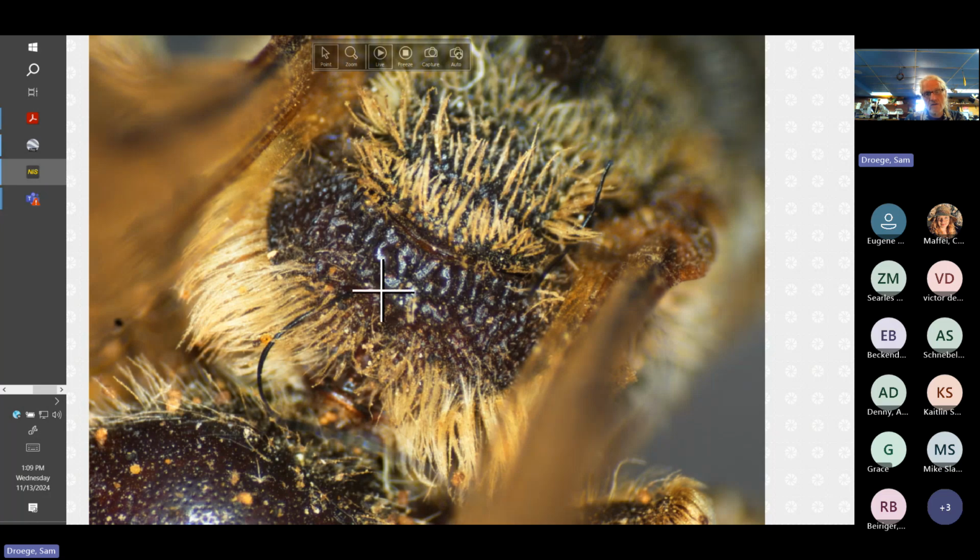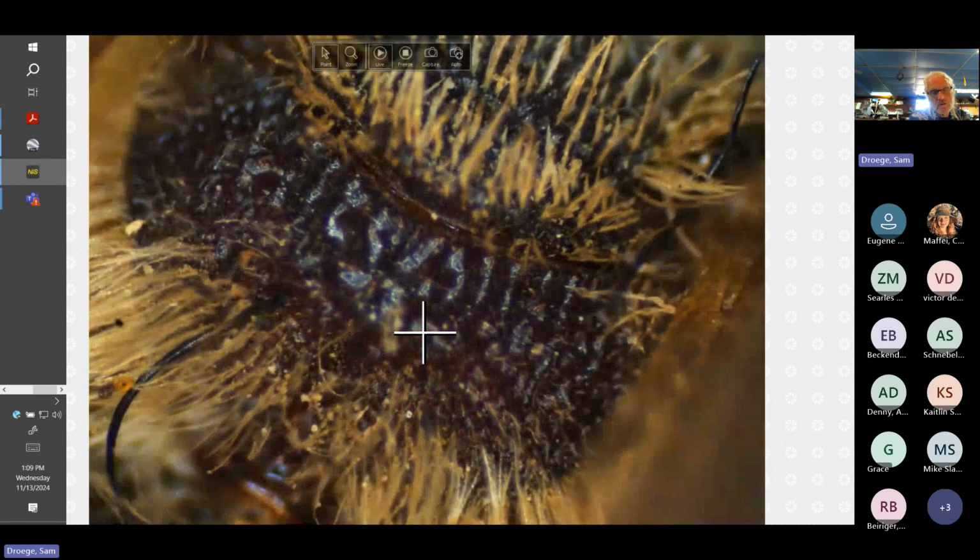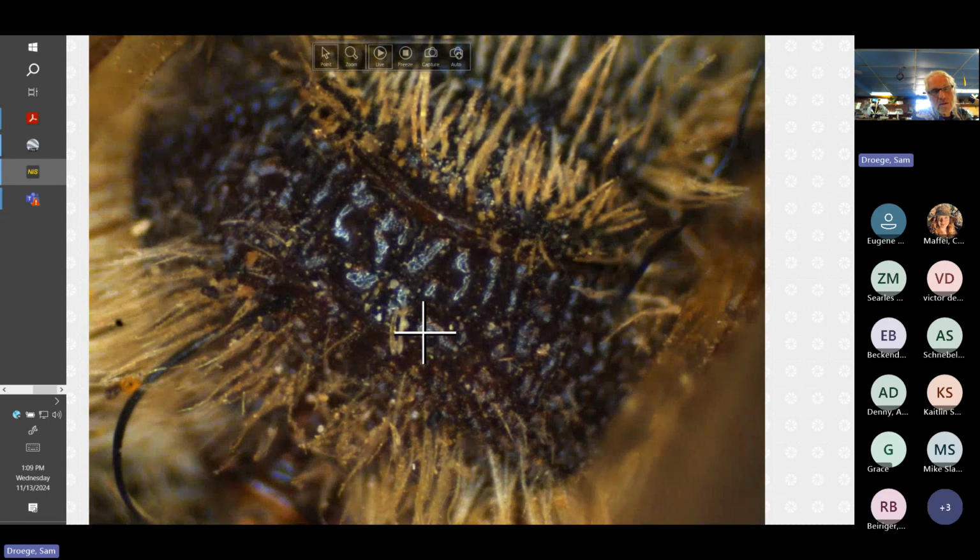So you can really see the triangular shape, and the tip of the triangle bends over onto this rear face, sometimes sharply, sometimes gradually. And it's a little bit hard to see anything in clear for just a dirty old specimen, probably 100 years old. I'll zoom in a bit here.